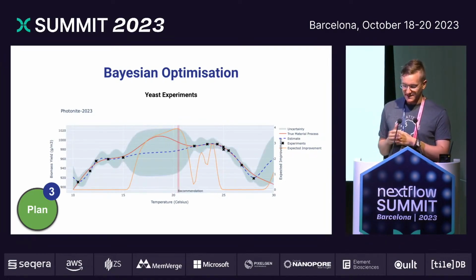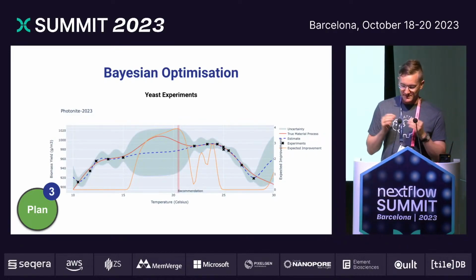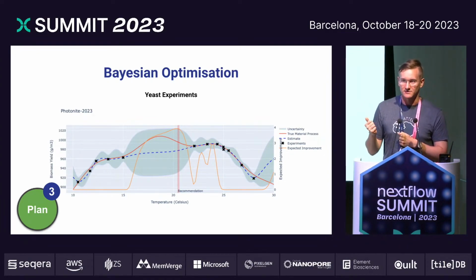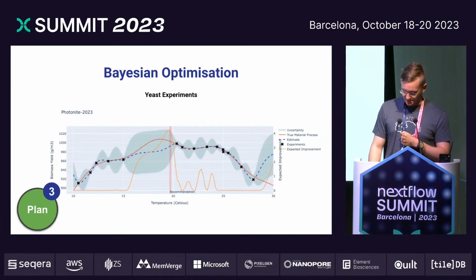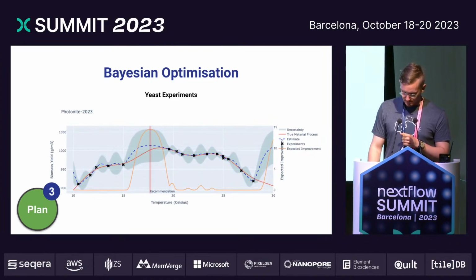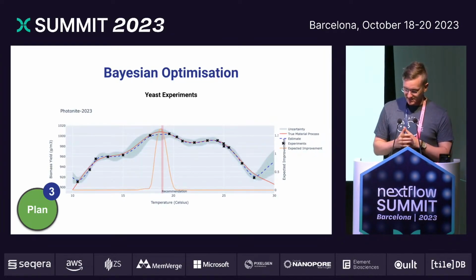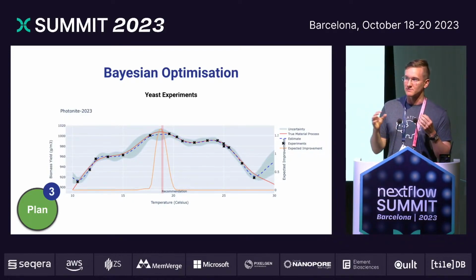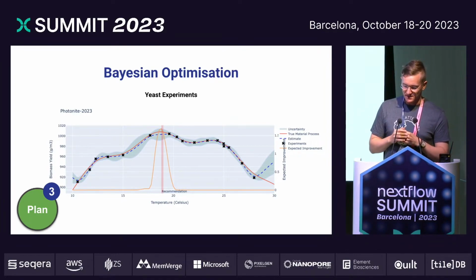And now we put in the data point here, and now the machine learning model, as you can see, is slowly squeezing out the uncertainty in an efficient way. And furthermore, we're actually moving to the optimal point at 18 degrees Celsius. So a few more steps. There's 18, there's 19, there's 16 Celsius, and then finally at 18 degrees Celsius, we have reached the maximum point. So machine learning with optimizing around these uncertainties eventually will converge to the optimal temperature.